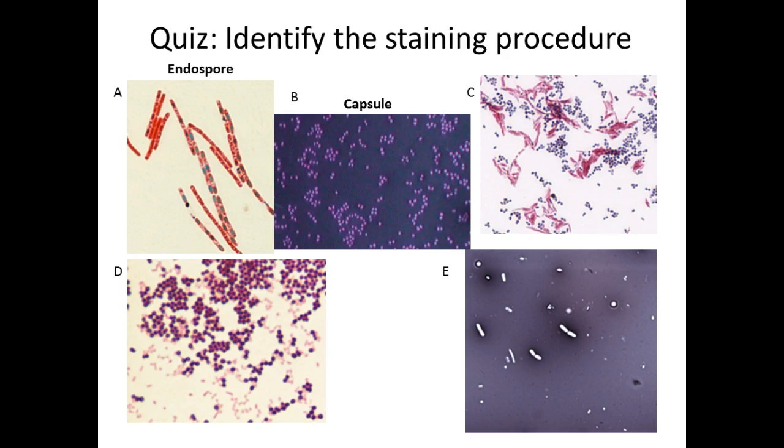The next one, what colors do you see? Well, first of all, how many colors do you see? 2. So it's probably differential stain, right? But what colors do you see that'll help us determine which differential stain? We see that purplish, reddish color, right? And kind of bluish other cells. Another key characteristic you'll notice about these cells is they tend to clump together. But when you look, see how they're rods? Bacillus? So anyone guess? This is acid fast. This is one of the ones you'll do today. And hopefully it'll look like that.